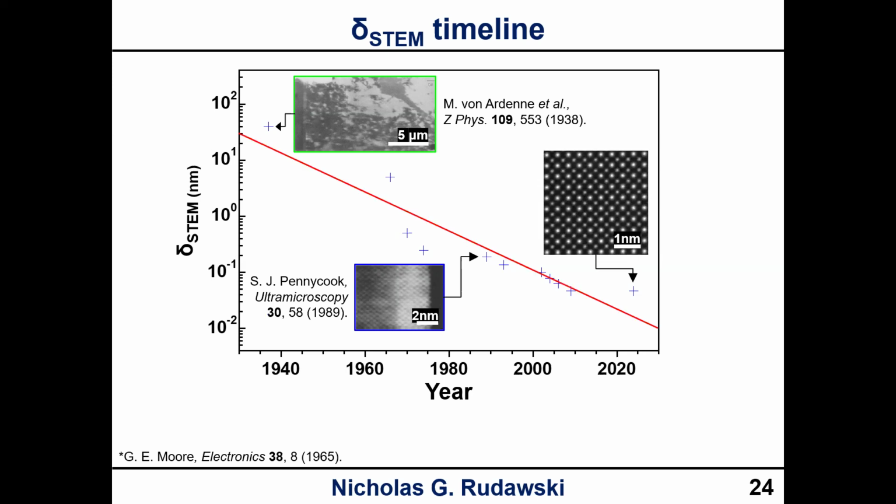You can actually regress this, and you get something that looks like this. So it's interesting, if you regress this, it's telling us, oh, we should be better than we are right now. So as far as I know, we haven't gotten below the 47 picometers that we have currently seen, although I don't know, strictly speaking, if that's true.